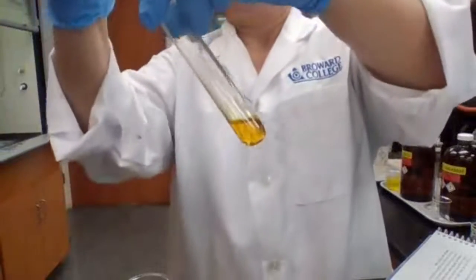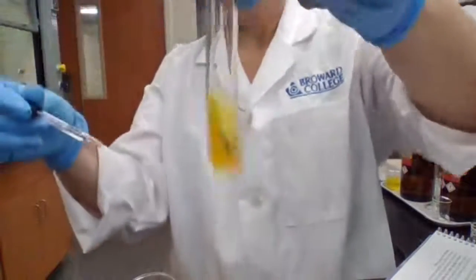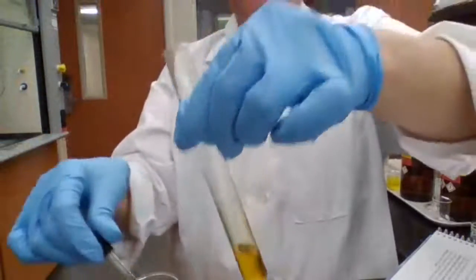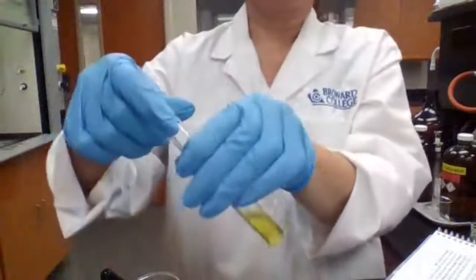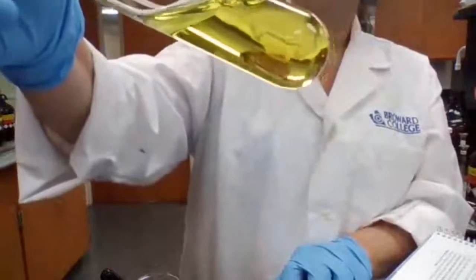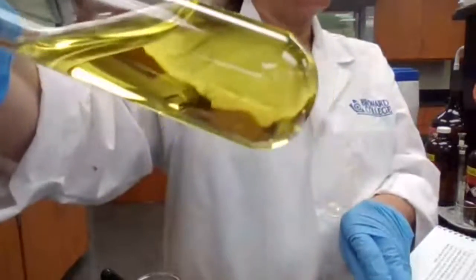Because the concentration of H2SO4 was 3 molar and this is 1 molar, it might take a longer time, but eventually you will see the color change again. Okay. Record the new color. This is after addition of sodium hydroxide.